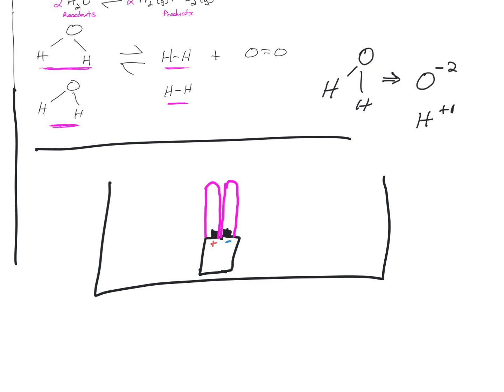Now, when it's first broken up, because of the electricity, when we break these bonds, where's the oxygen going to go? To the positive or the negative? To positive, because opposites attract. And so when you first break it up, you're going to get little bubbles, right? Bubbles of oxygen, do you agree? It's going to start forming. Where are all those bubbles going to go inside the test tube? To the top. And what's going to happen to the water that's in the test tube?